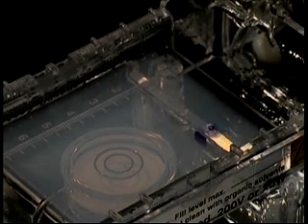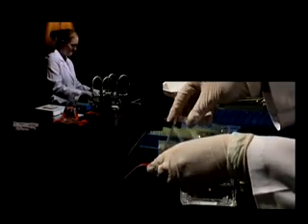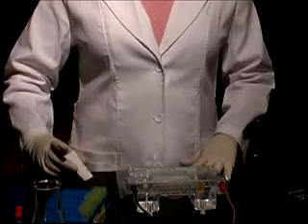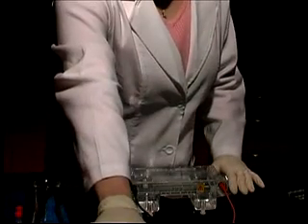Snap down the covers of the positive and negative electrode terminals and make sure they're properly oriented. Connect them to the power source and run the electrophoresis for a time specified by your instructor. Bubbles should form on the electrodes if the current is flowing. Allow the tracking dye to migrate at least 4 centimeters to allow the DNA bands to separate. Once the electrophoresis is done, turn off the power, unplug the electrodes, and remove the cover.